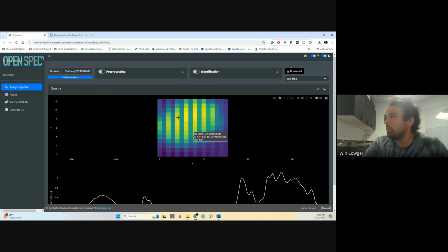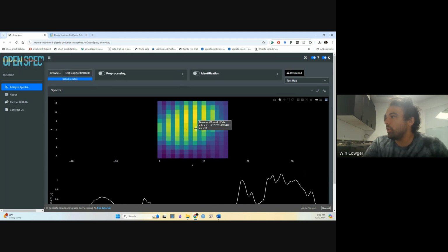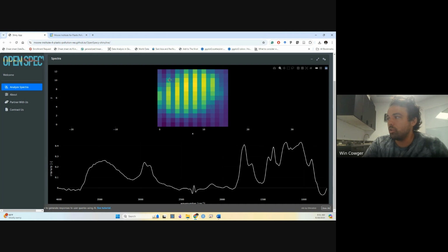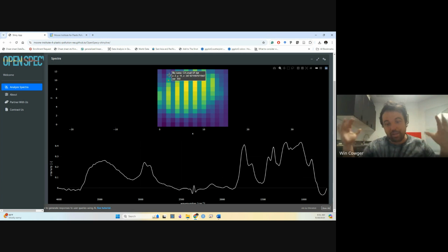All right. And so what this will let you do is figure out along this particle, especially looking at its edges, we can identify a threshold for the total signal that will make sure that we're just getting the particle spectra. You want to keep it at a 1,000-foot view when you're first trying to set up this particle ID routine.